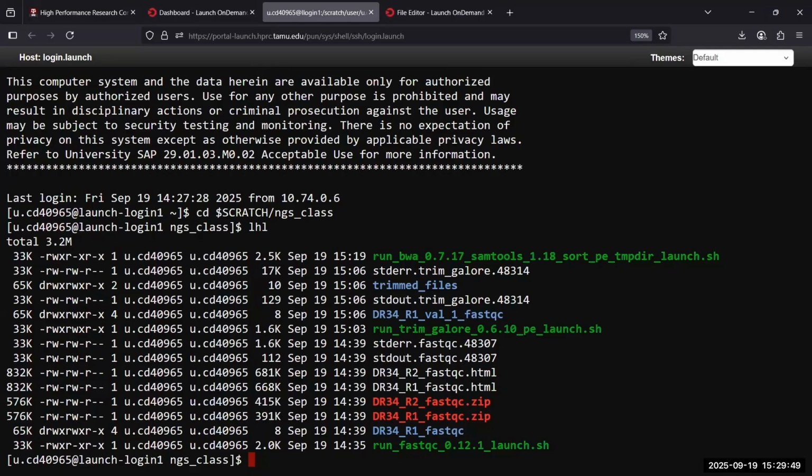Yeah. And highlight all that. You need to close the quotes. You got two scratch slashes there, so you take one out. And then save that in case you get booted off again.